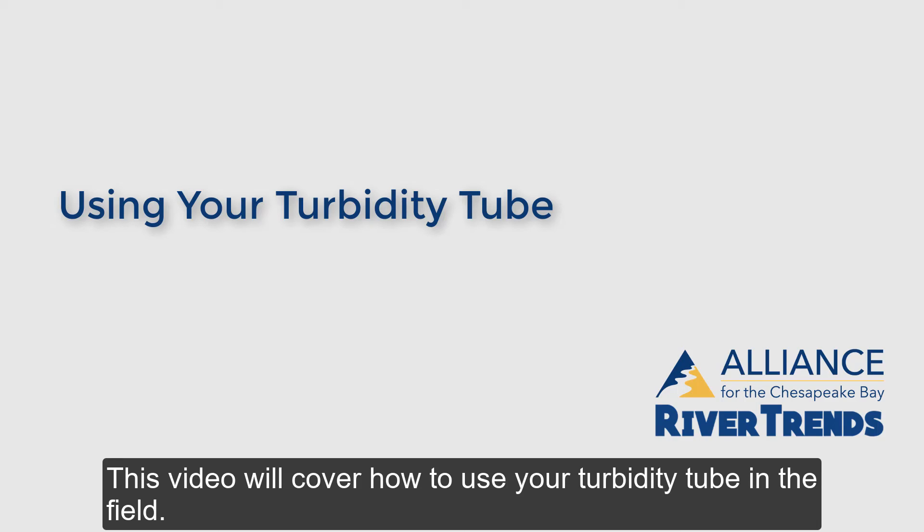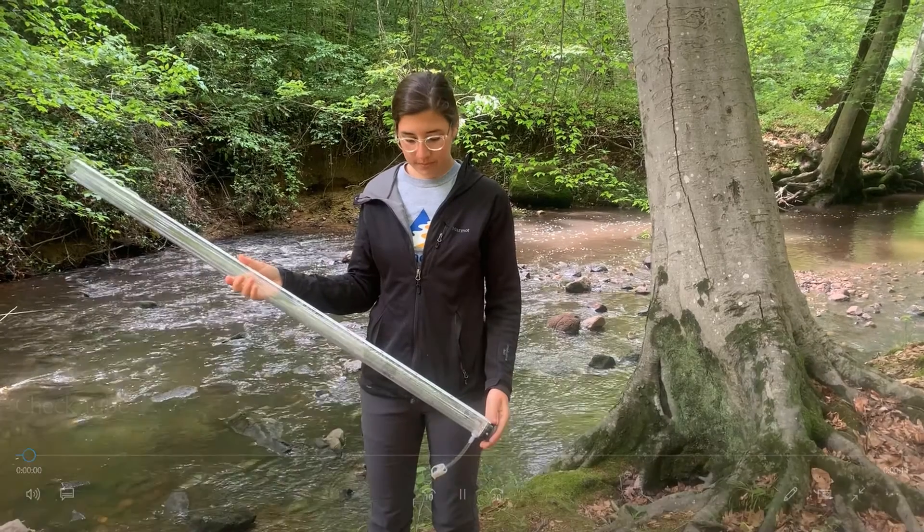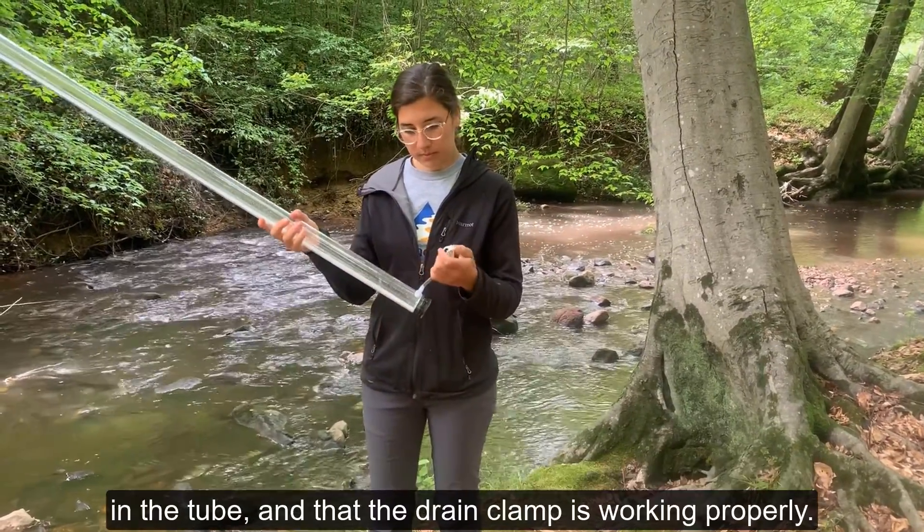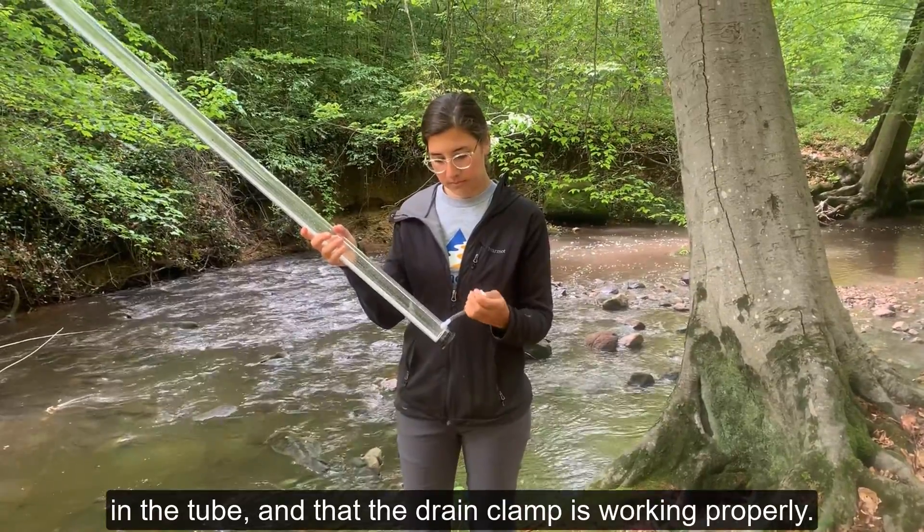This video will cover how to use your Turbidity tube in the field. Check to make sure that the black and white disc at the bottom is visible, there are no cracks in the tube, and that the drain clamp is working properly.